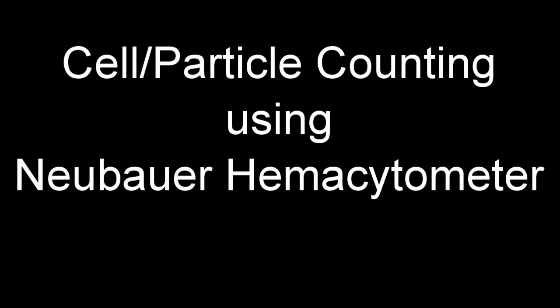In this video, we're doing cell or particle counting using the Neubauer hemocytometer and we'll calculate the concentration per unit volume.